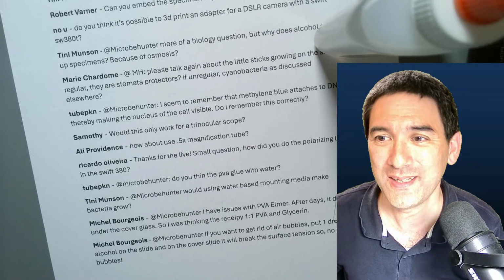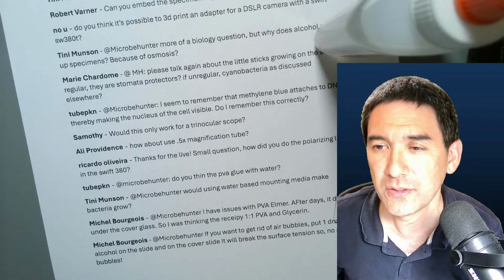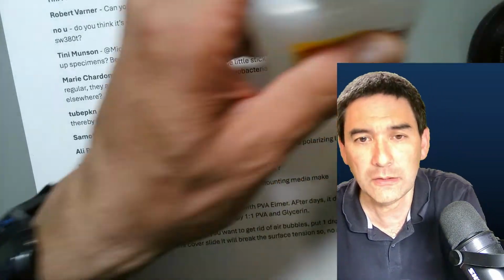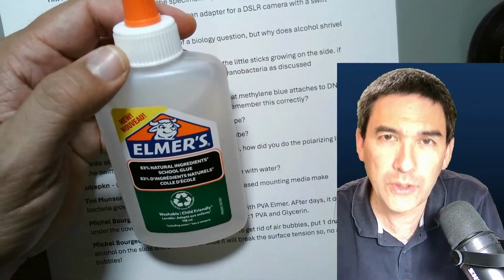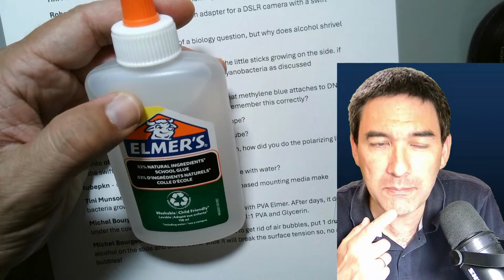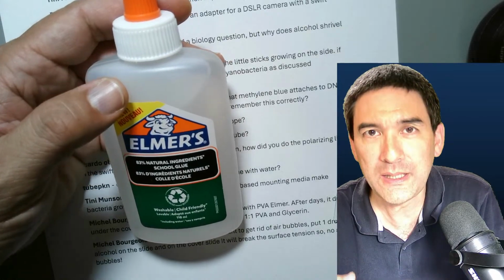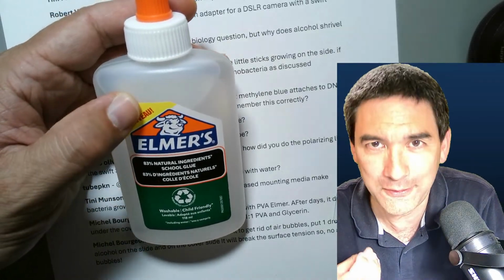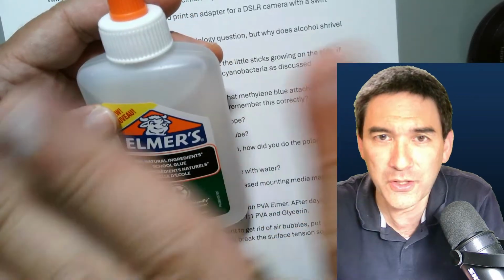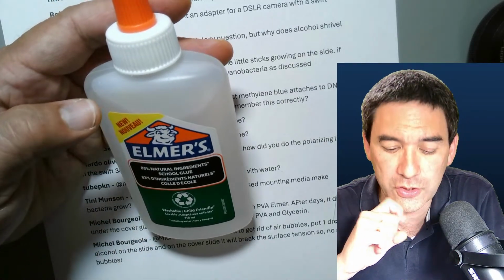Yeah. So I meant the PVA glue evaporates after days while drying. It disappears. The thing is the following. Let's put it this way. The PVA glue contains, of course, water. And when the water evaporates, there is always a certain amount of shrinkage happening. Now, it could be that if you added too much water to the PVA glue, then the water will evaporate, and there is actually too little of the actual glue left on the slide. So maybe this could be a reason. Okay, so if there's too much water in here, it's nice because it flows very nicely, but then there might be also more shrinkage, and then it will actually become smaller. Yeah, so this could be a reason.